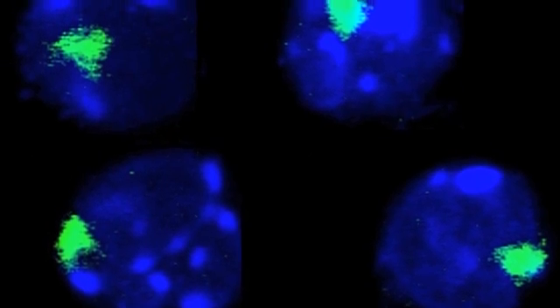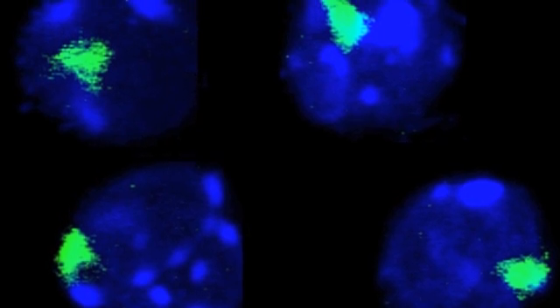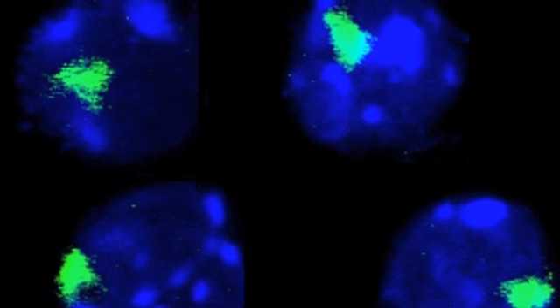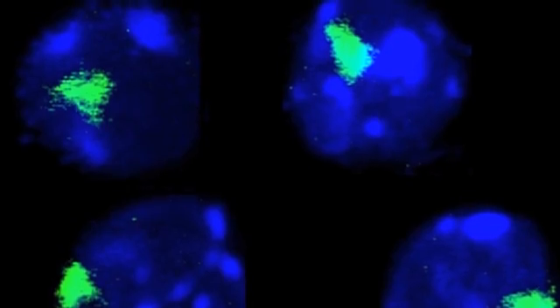These are four typical cell nuclei in which we've stained all of the DNA with a blue dye and one of the chromosomes in green. You can see it looks nothing like the familiar X-shaped cartoon structure of a chromosome.